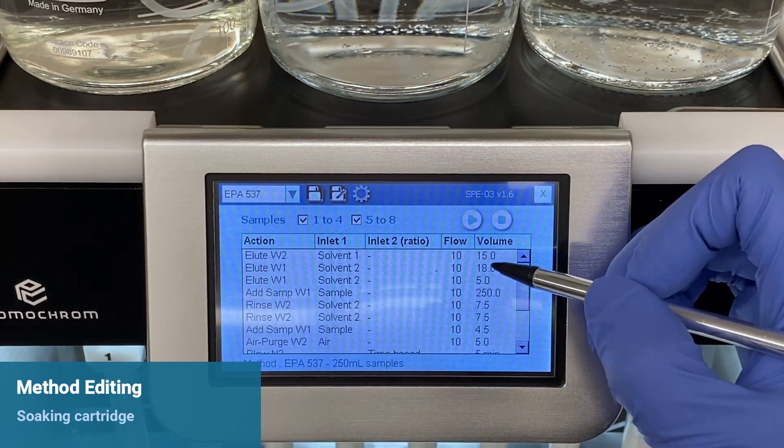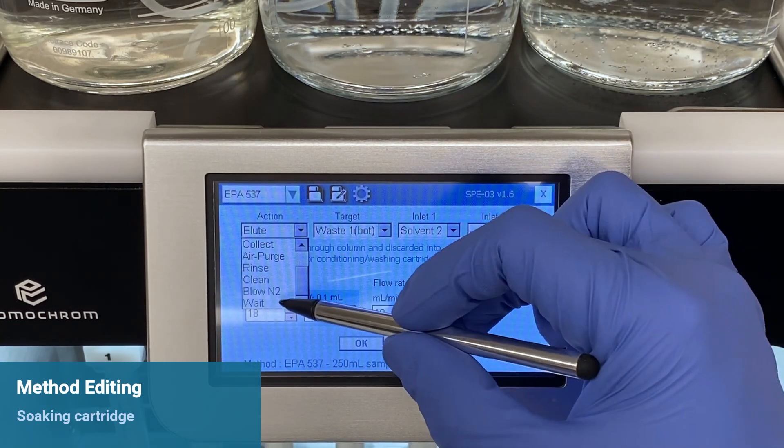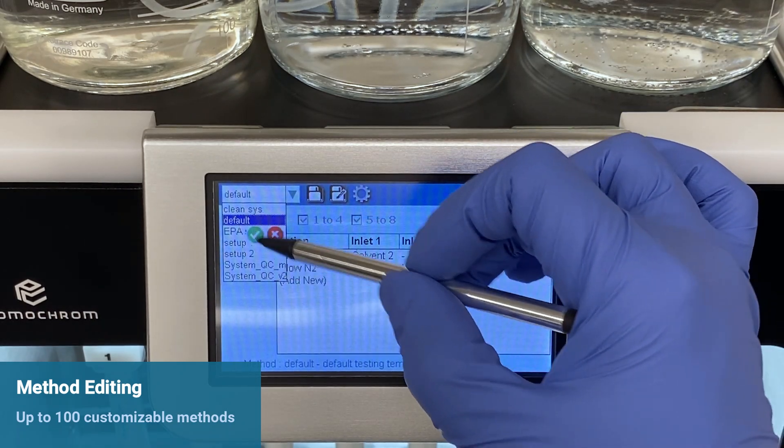If your method requires soaking the SPE cartridge, you may add a time-based wait where necessary. Up to a hundred different methods can be stored and accessed on the system.